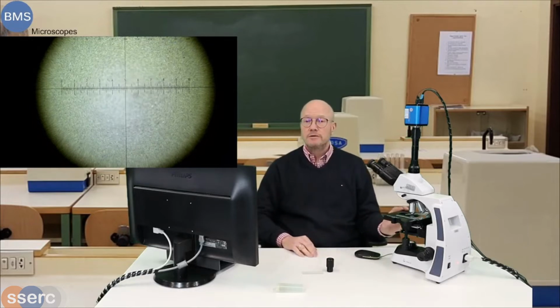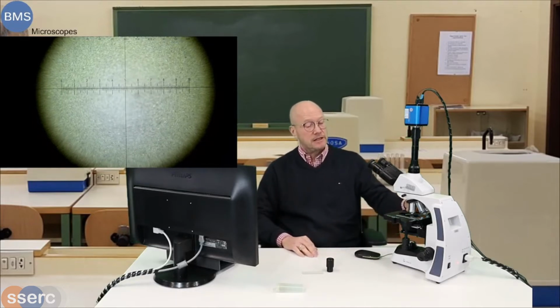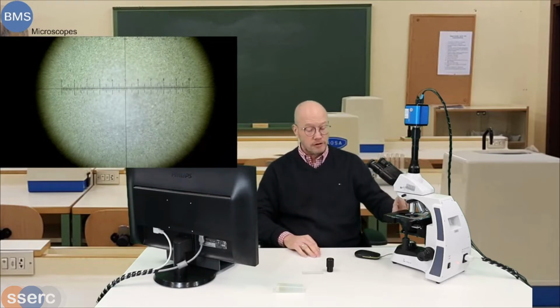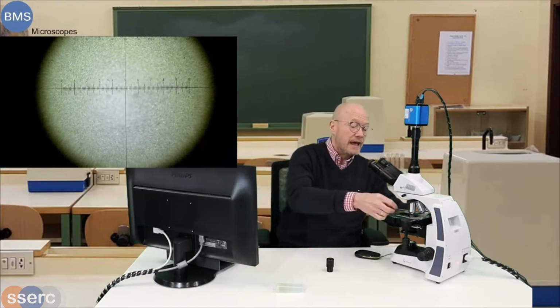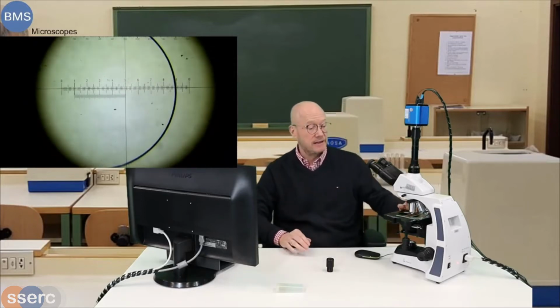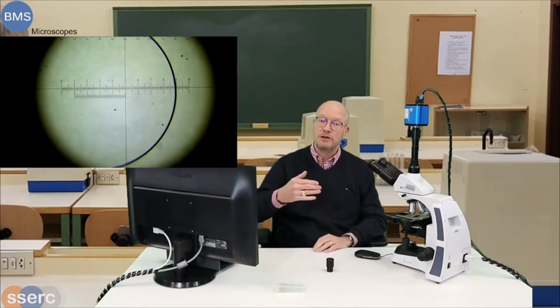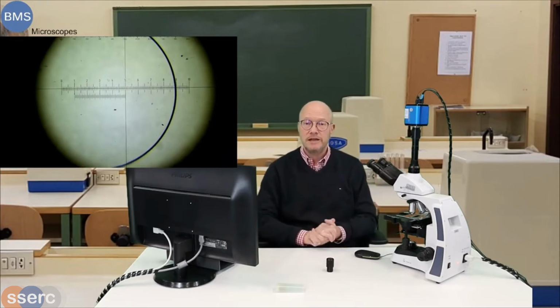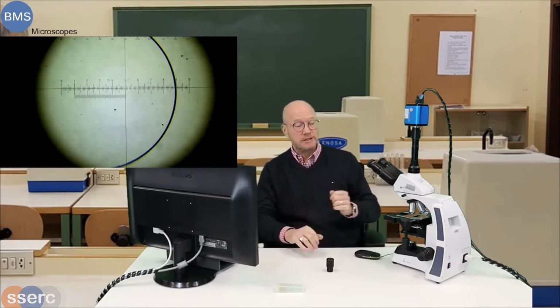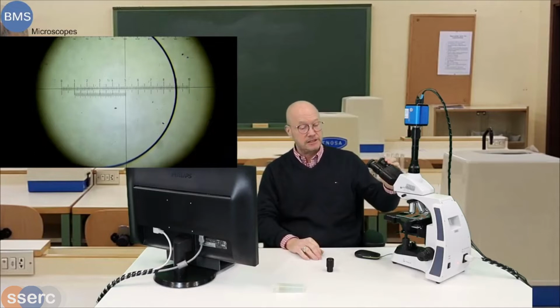We go now to have a look at the eyepieces, with the 10 times eyepiece with the graticule, together with the stage micrometer. We have to calibrate each objective, because the moment that you start changing the objective, you also change the total magnification. Magnification of a microscope is made by the eyepieces in combination with the objectives.